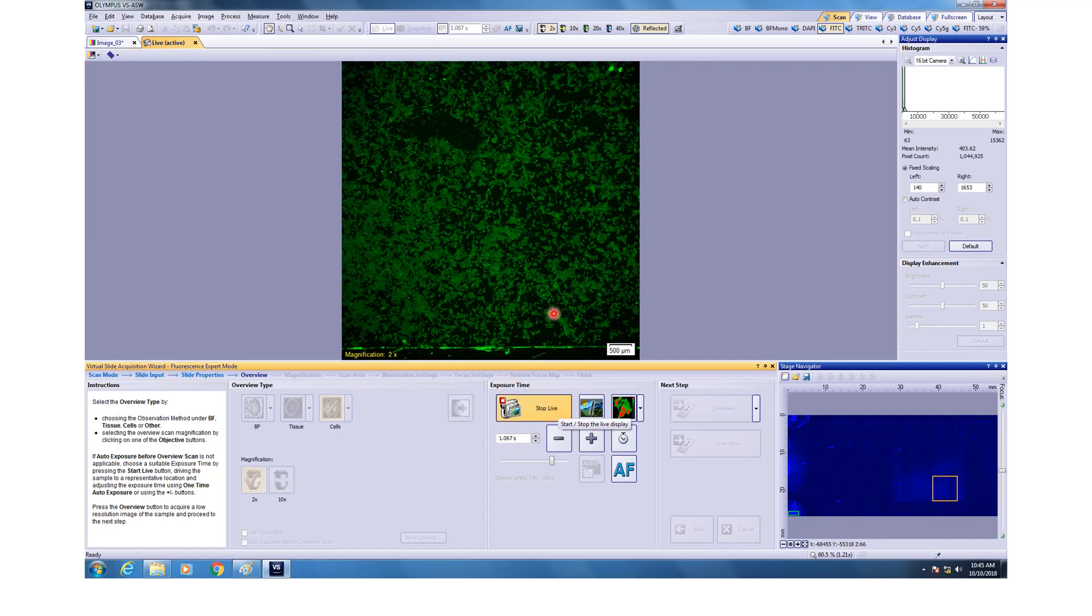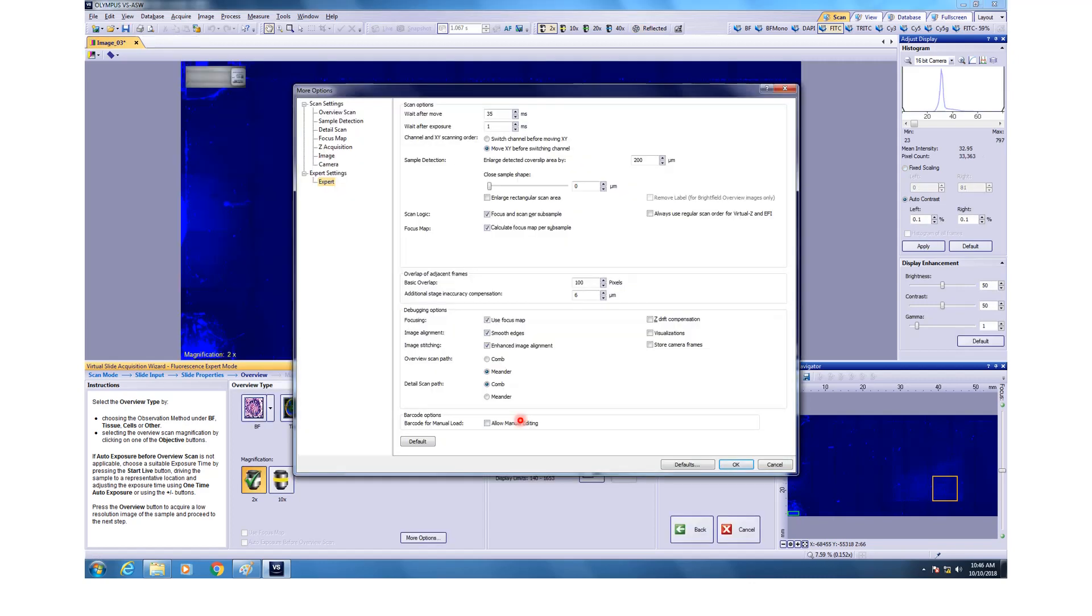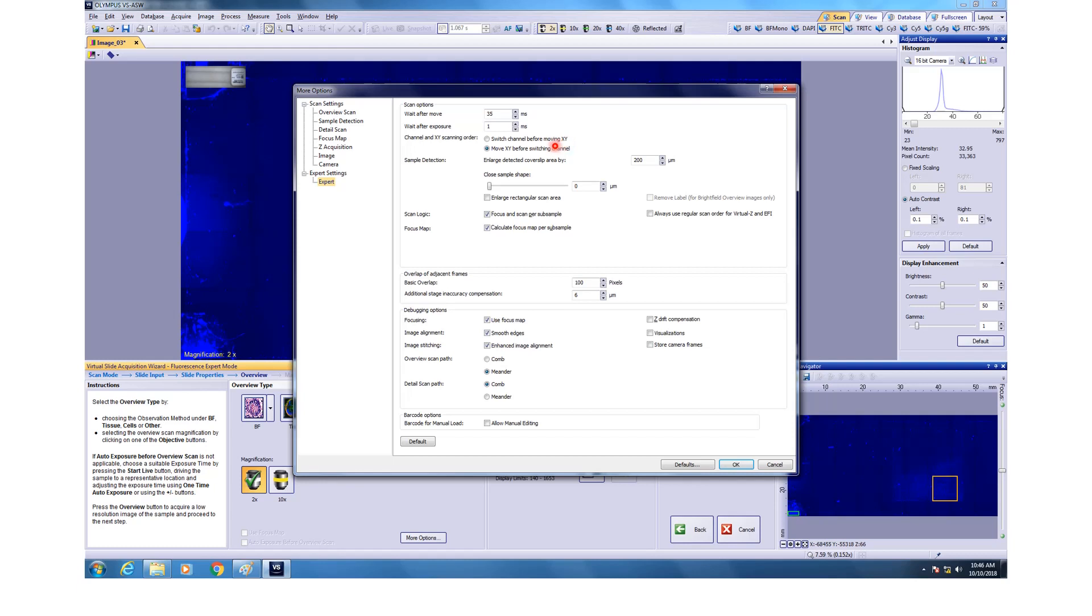If everything is fine, then just stop live and then you can go for overview. And here is one more important parameter. If you want to get this dialog box, you click more options while pressing the shift button on the keyboard. If you do this, then it will give you an option in the expert mode where you can select whether you want to switch between the channels before moving XY. This is good if you are doing colocalization, but it will take a lot of time to image. But the microscope stage is actually decent enough that it doesn't give you too much of shifts between the two channels if you are doing one channel at a time. So I would recommend going for move XY before switching the channel. That will save you a lot of time as well as good for the health of microscope.